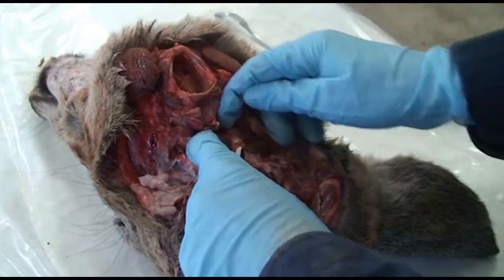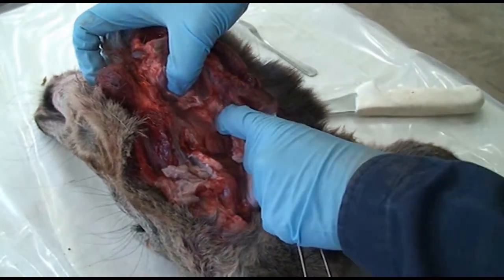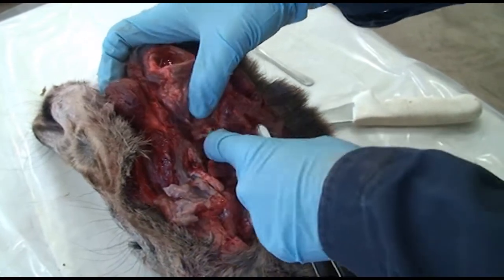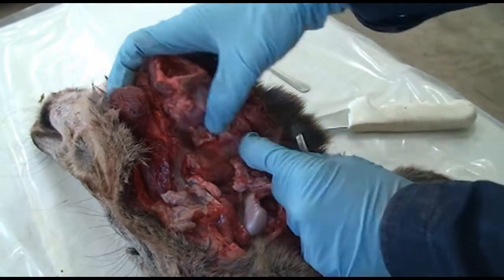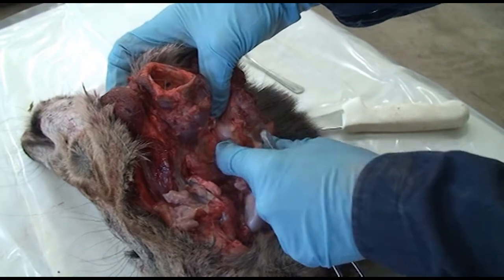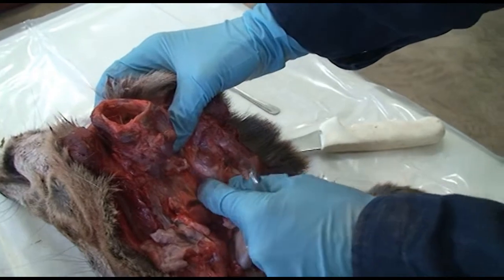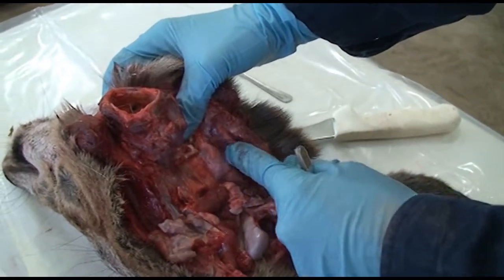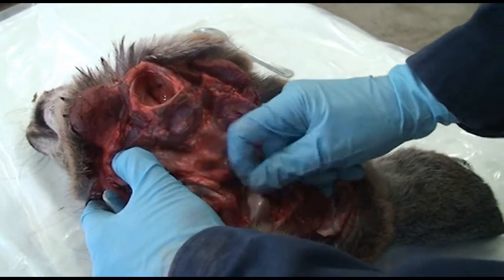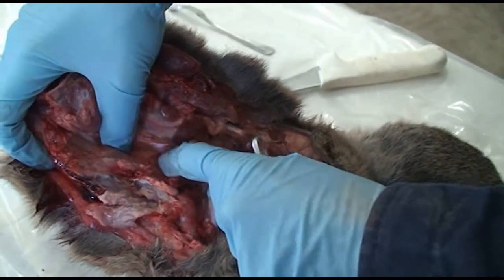The other thing is you can sometimes put your fingers in the divot of the area where I showed you, and you can sometimes actually feel the lymph node sitting down in those pockets when you're looking for it. They're going to sit a little bit lateral and tuck up next to the salivary gland. And the lymph node has a capsule on it, so it's going to give a smooth, glistening appearance when you're looking for it. And there's one on each side. They tuck down in here, so you're going to have one down in this pocket also, tucked up next to the salivary gland.